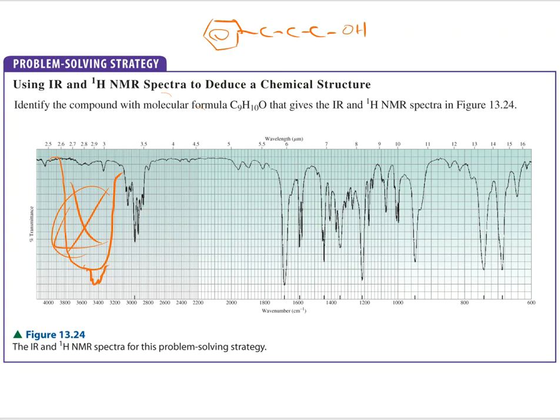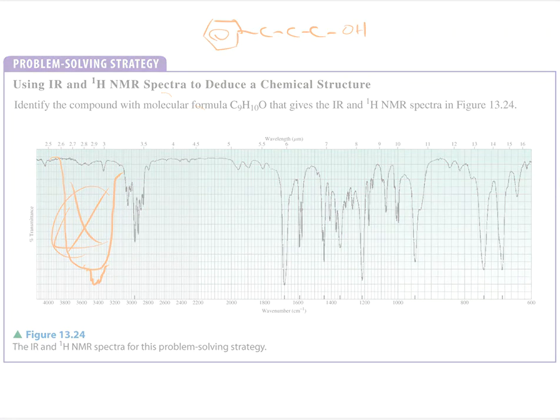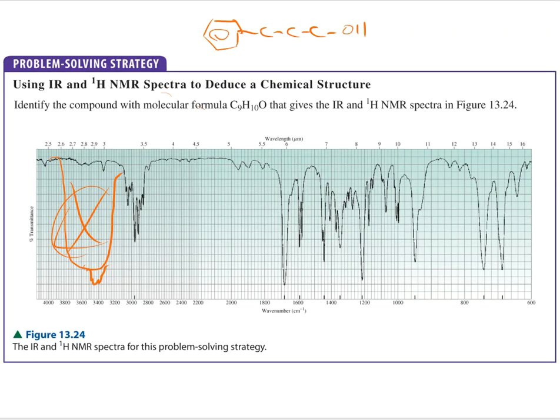So what other functional group do we have that takes into consideration this kind of oxygen functional group? Well, you're going to look at this and say, I know what that would possibly be. That would possibly be in the ketone family. So do we have an aldehyde? What if it was at the end?